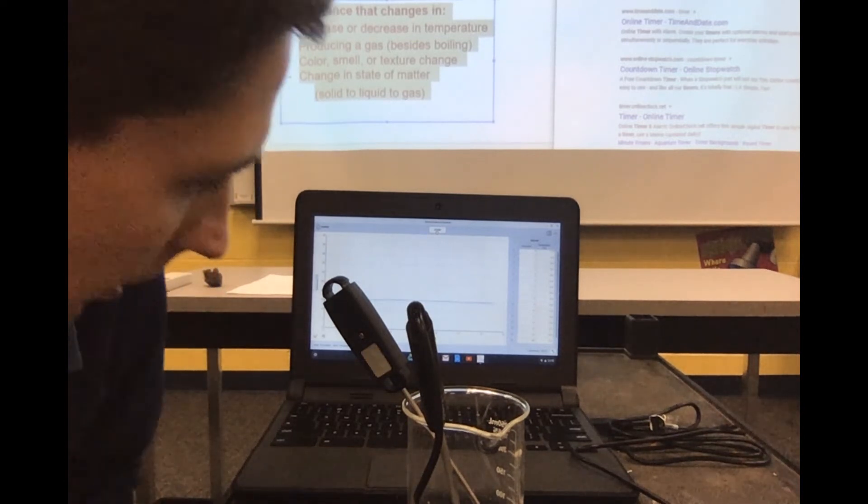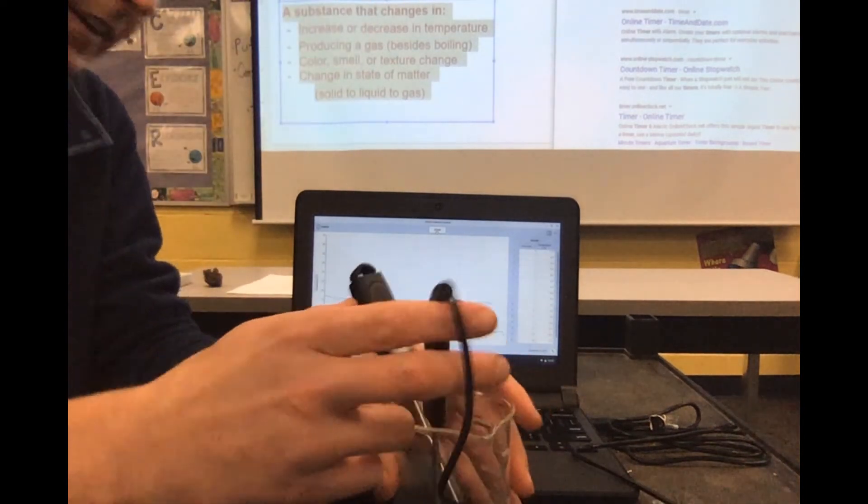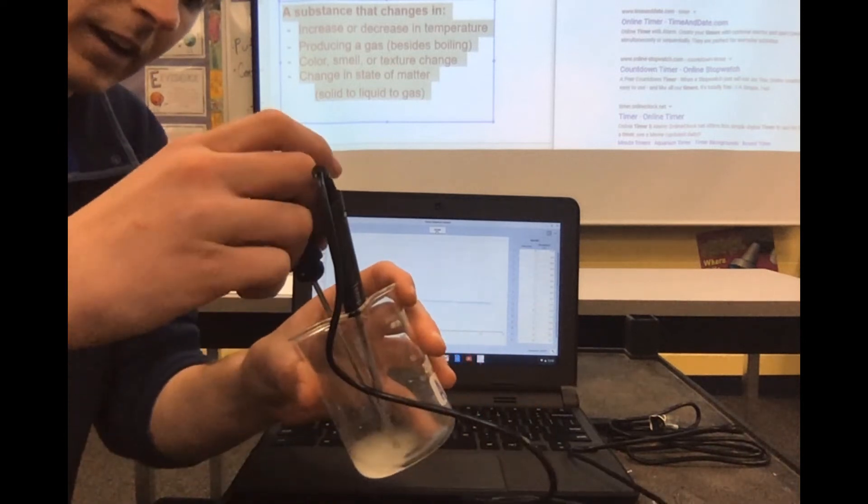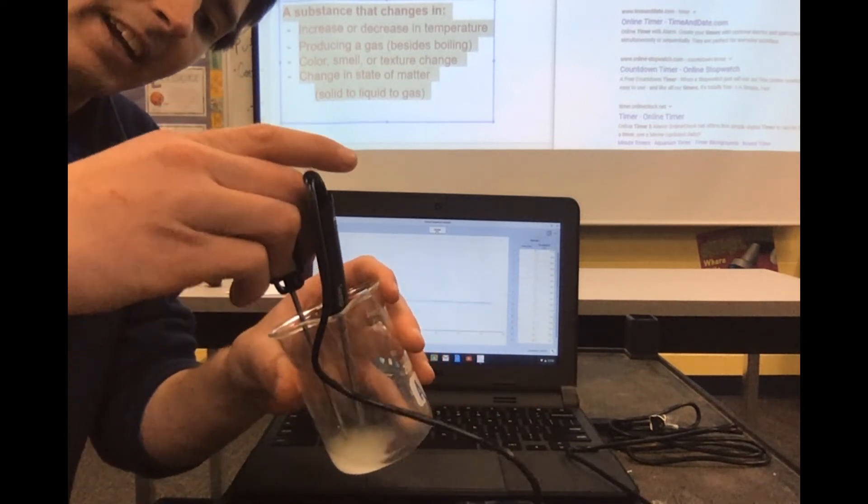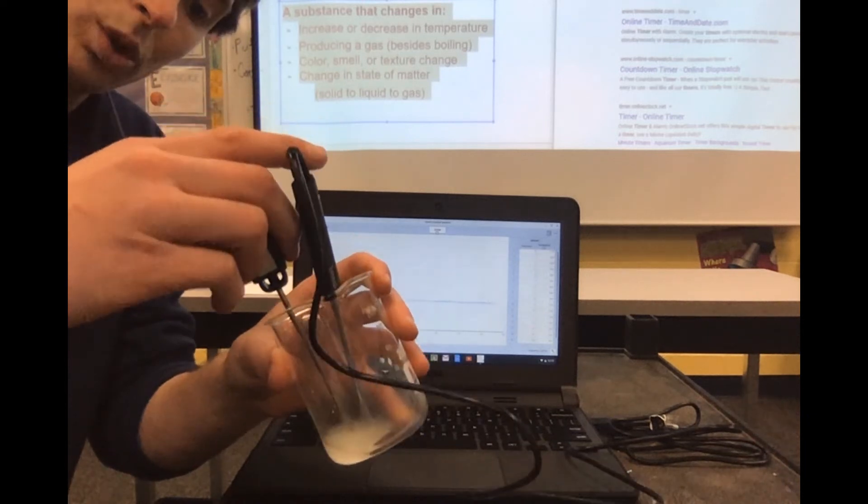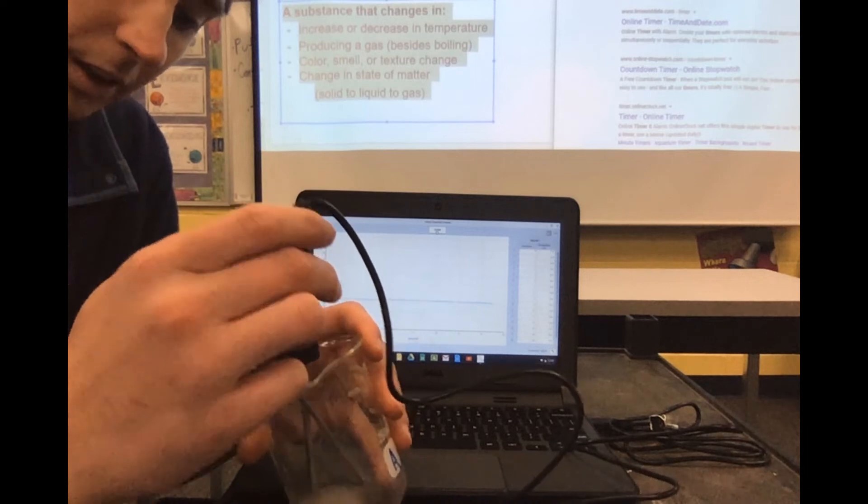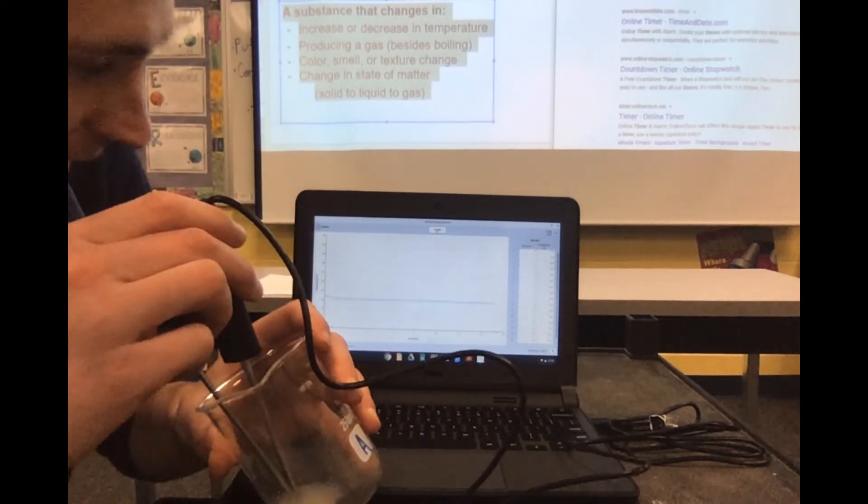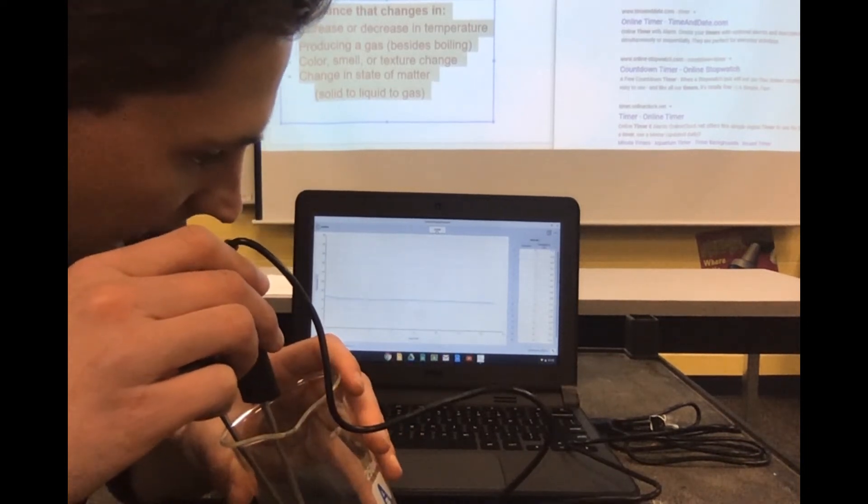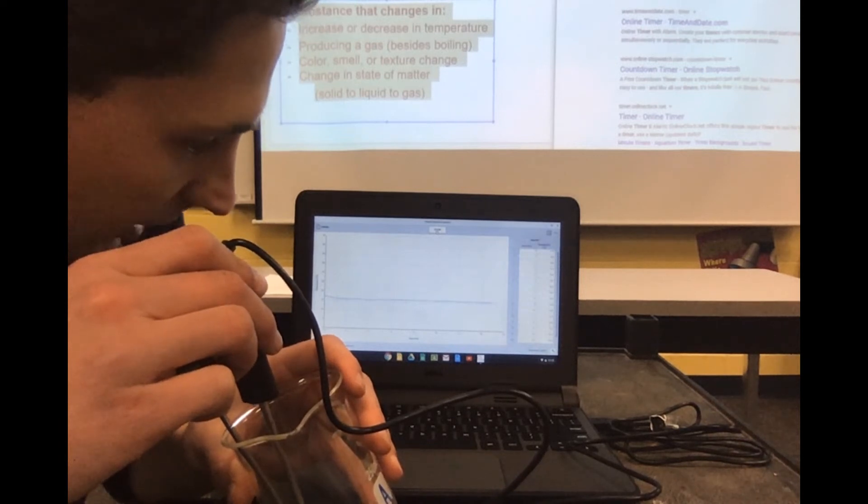We are on 59.2 degrees Fahrenheit. It went down quite a bit. That one didn't, at first that's what it said. And then this one is 15.0 degrees Celsius. So you can see the temperature decreasing.